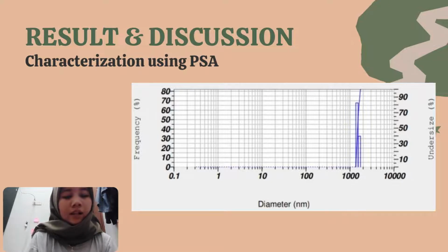The valency of the iron salt used also plays an important role in determining the size of the iron oxide nanoparticles. In the co-precipitation method, generally a black precipitate of iron oxide nanoparticles is formed after mixing the iron salt solution and the base. The reaction is as follows.